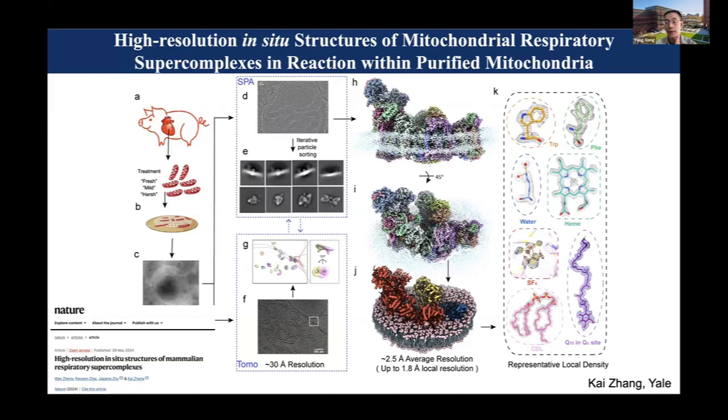Now, what you normally can do with a purified sample, you can do with this: build high resolution atomic models and also fit all the ligands. Then the beauty of this type of work in situ is this. The condition is minimally perturbed. We should not say it's not perturbed at all. It's almost as much as inside the cell, so that you don't lose some transient states. You don't lose components that are weakly bound during purification. You may lose them, right?